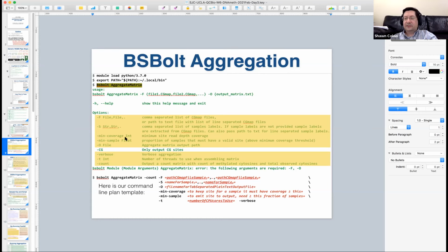Then you're willing to tolerate the loss of 1. Some rows will be complete, and some rows will have 1 missing, and the missing one will bounce around, but nobody will have 2 missing. That's not allowed by your request. Okay, so now we can talk about this. We'll do that in a second. Let's talk about the translation from the fraction to the threshold and why it's problematic.